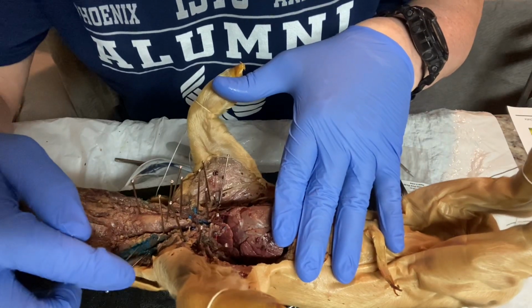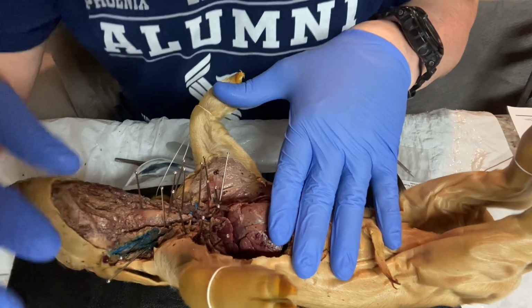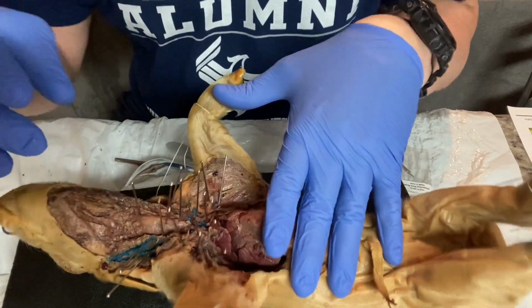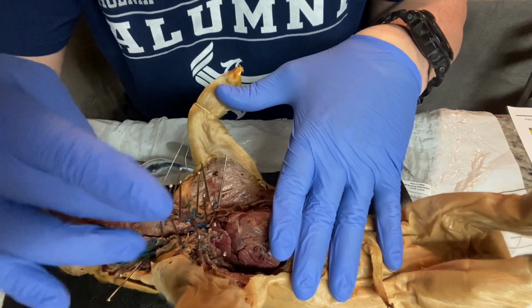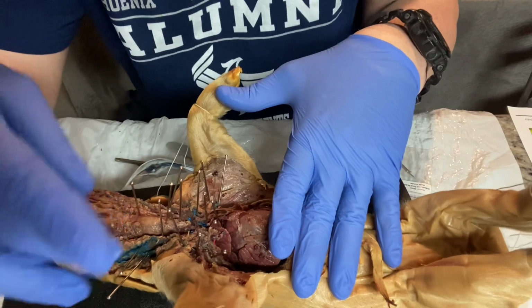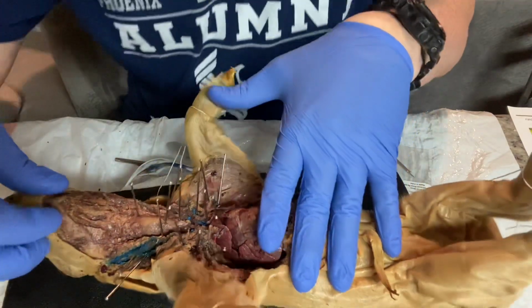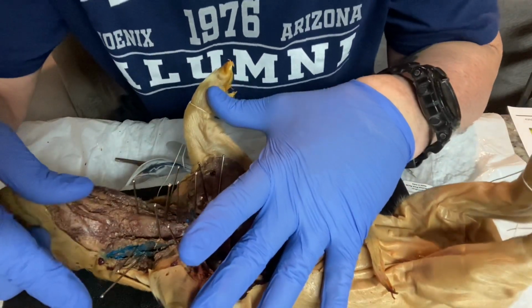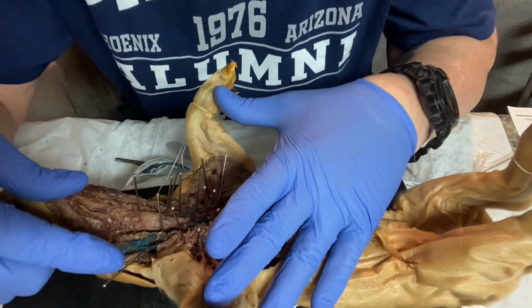So here you have the internal jugular vein, external jugular vein, and some of these veins and arteries have dye in them. Blue representing veins, red or pink representing arteries, but some of the arteries and veins have been cut and spilled and kind of have been all over the place. But here we go. We have the external jugular and internal jugular with this vein.